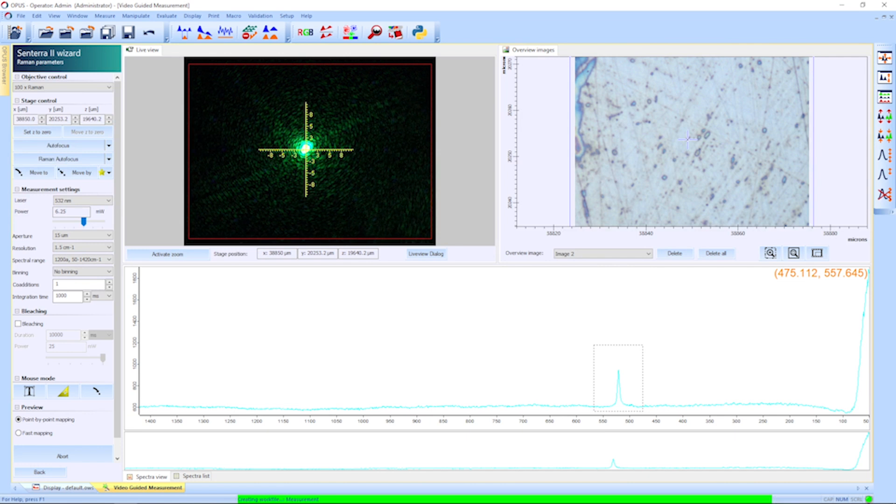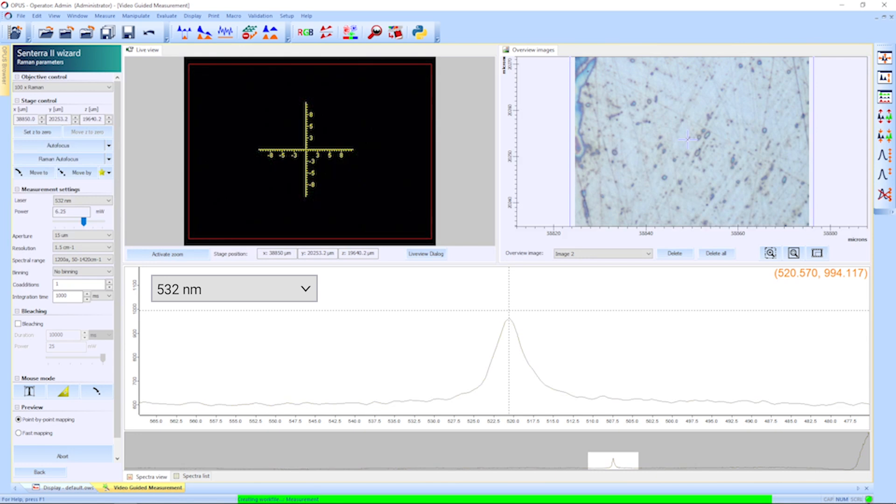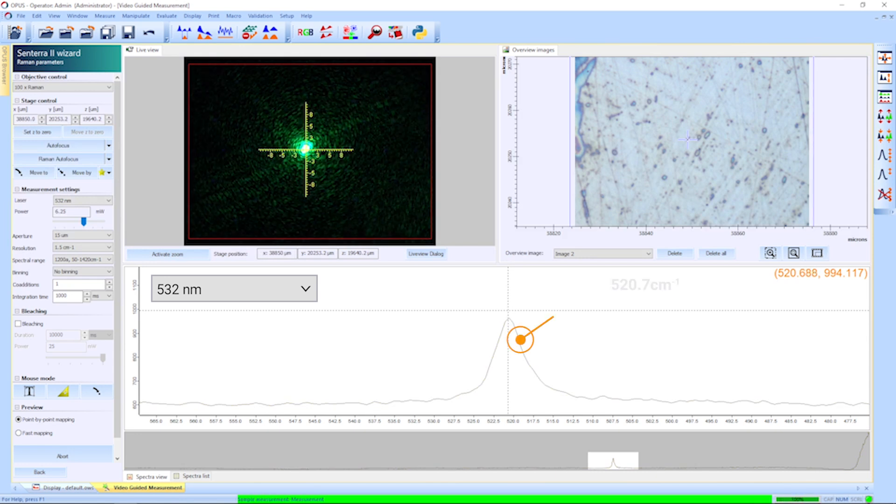This is a live spectrum by using a 532 nanometer laser. The Raman peak for silicon appears at a Raman shift of 520.7 wavenumber.